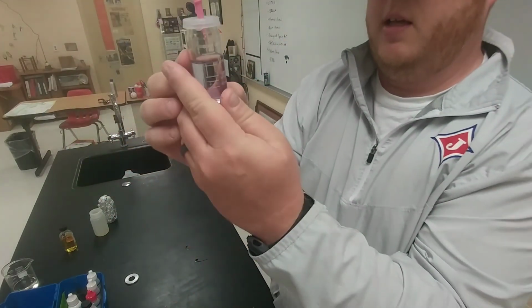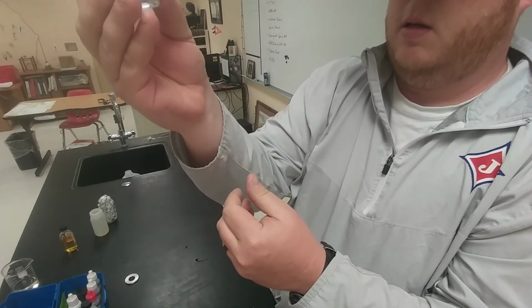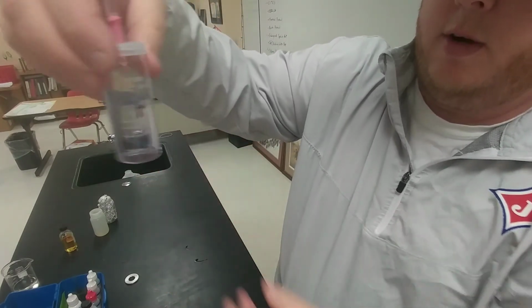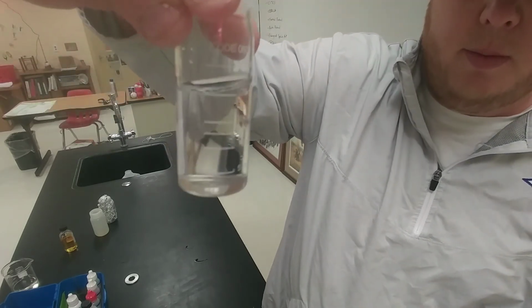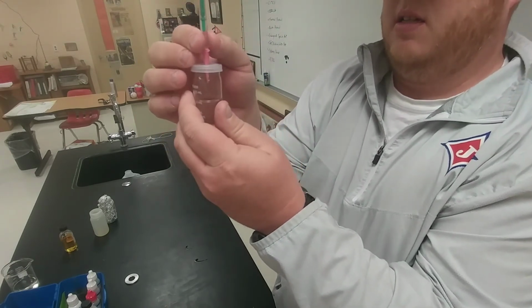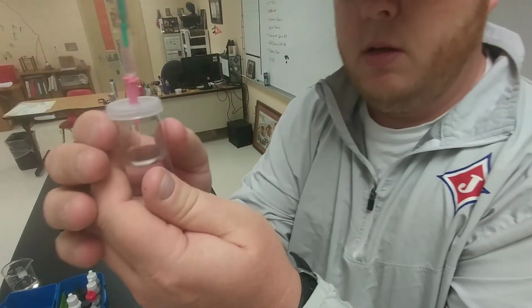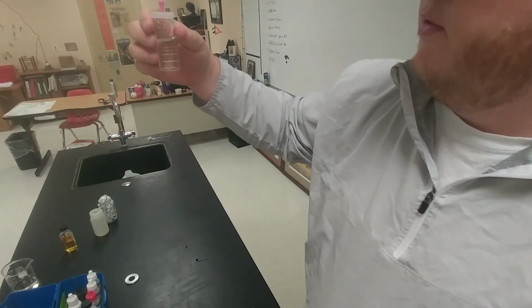I'm going to read. It's got a blue tinge to it, so I'm going to go 1 more drop just for good measure. Right there. Now it's totally clear. 100% clear. Okay, so I'm going to read the bottom of my scale here, and it looks like it's about 6.2. So 6.2 milligrams per liter of oxygen.